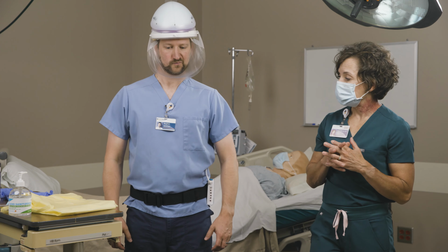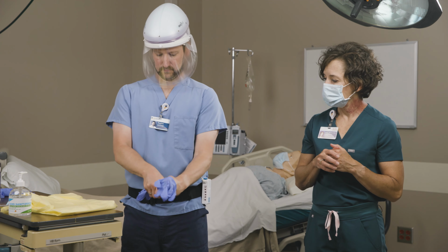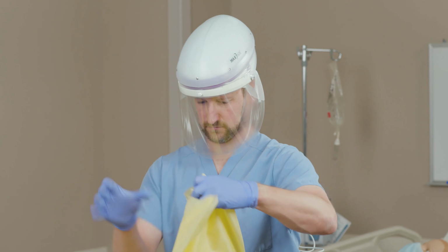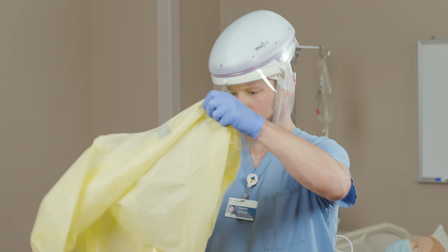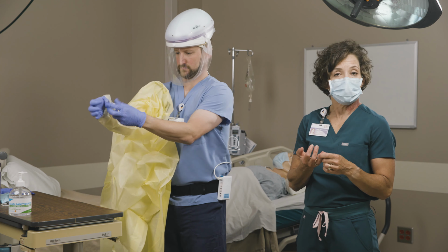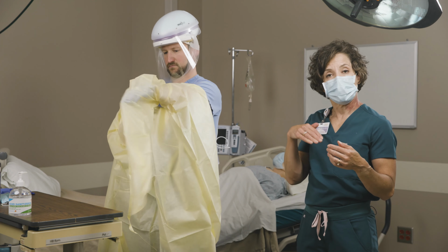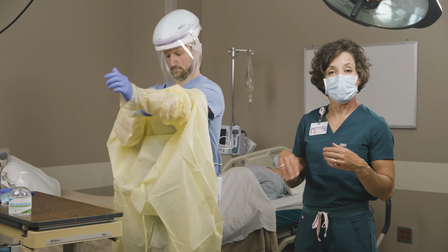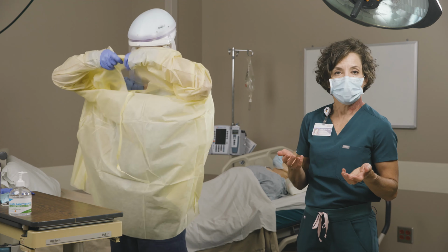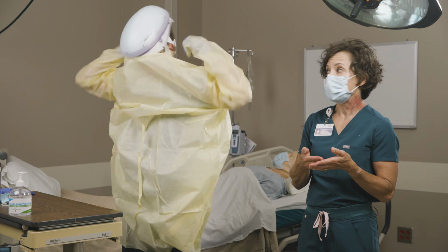Okay, next Stephen's going to don his first pair of gloves. And then he's going to don his gown. And we're demonstrating the process of donning the CAPR first and then the gown. Some facilities, people don the gown first and then snake the cord of the CAPR down through the gown before they tie it. Either way is fine. Please use the process that has been successful for you and your facility.